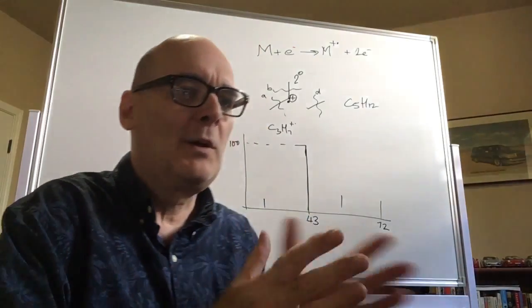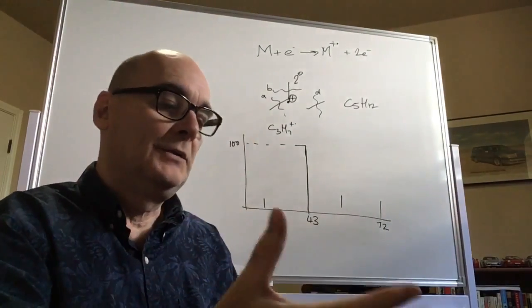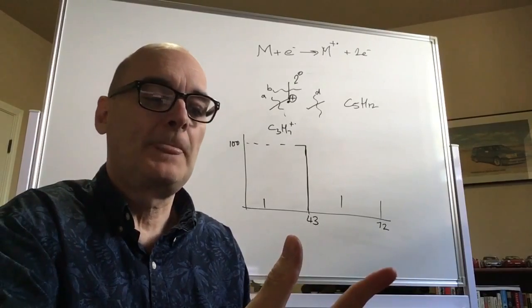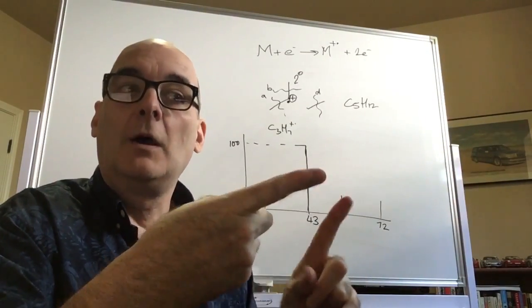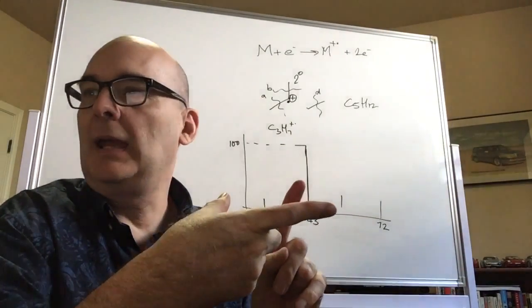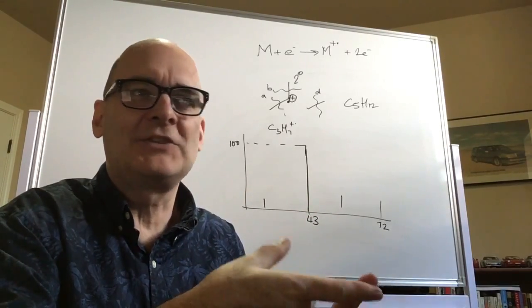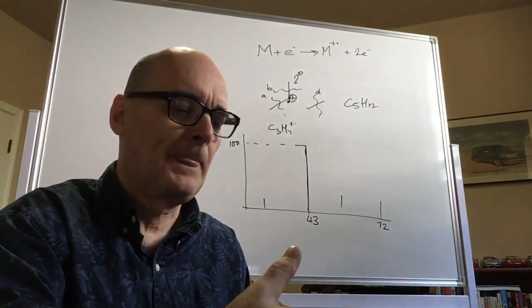Okay, so our molecules, they're going to be organic. They're going to contain lots of carbon, plenty of hydrogen. They might contain oxygen. Oxygen is an even-numbered atom, and it doesn't have much of an impact on what's going on in our molecule.